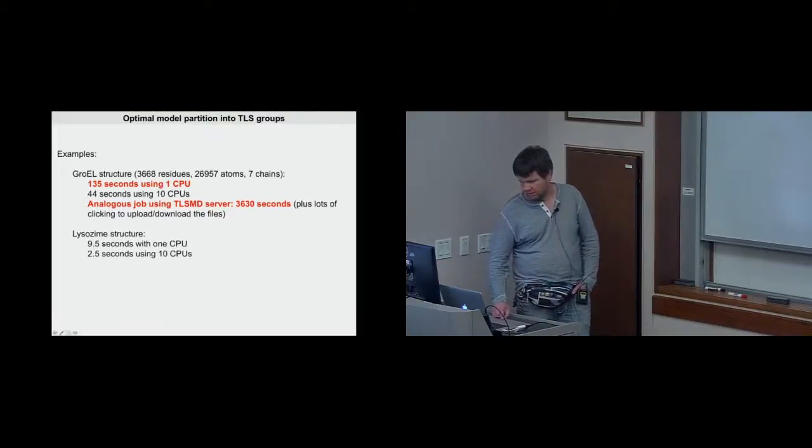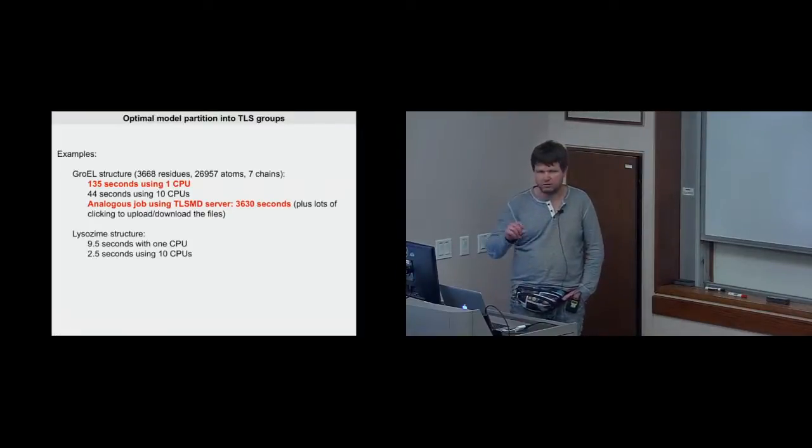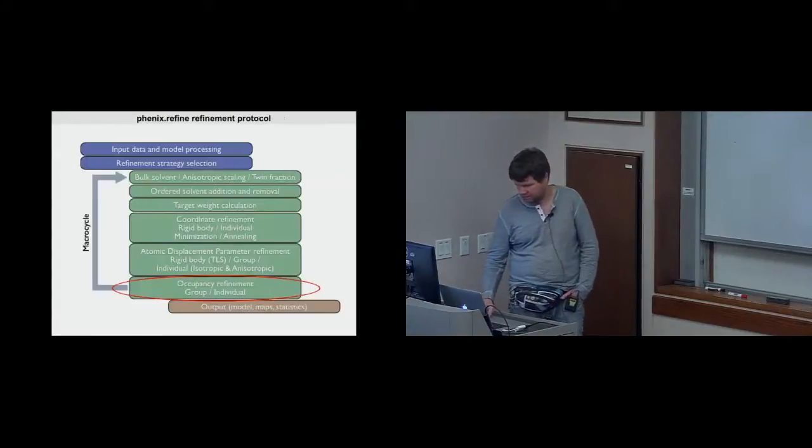And that is just another example. So what we have is pretty much interactive. You can launch it in the GUI. In the GUI, wait a few seconds, and you'll see your TLS groups. You can explore them and try to make sense of them.